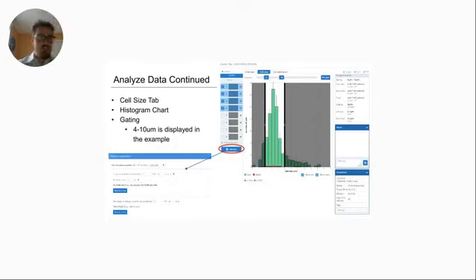All right. So lastly, on this page, we have a dilution calculator, which was just enhanced on the last algorithm update. And there's different functionalities here. So this is going to tell you how much cell solution you need to move on through your workflow. And Jeff will give us a live example of that in the coming minutes here.